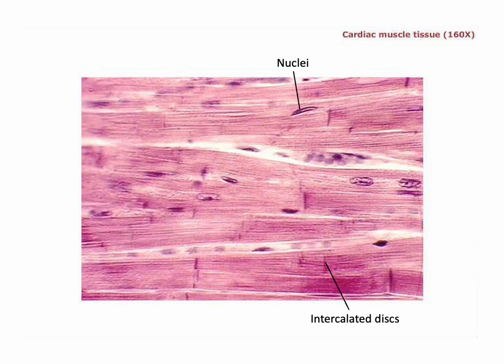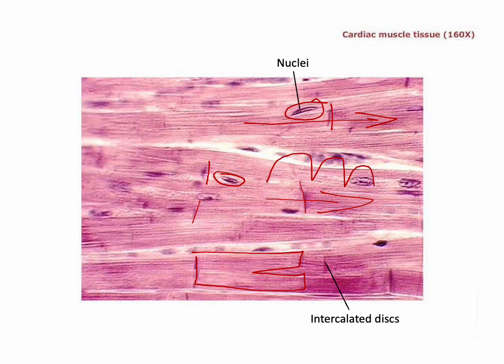First, we see the cardiac muscles. As we have mentioned in class, they kind of look like pants. So you'll see that they are striated muscle tissue, but also you will see the nuclei, right? And these little lines that are kind of perpendicular are the intercalated discs that work as junctions, so the information can go through instead of jumping around, making it more efficient, okay?